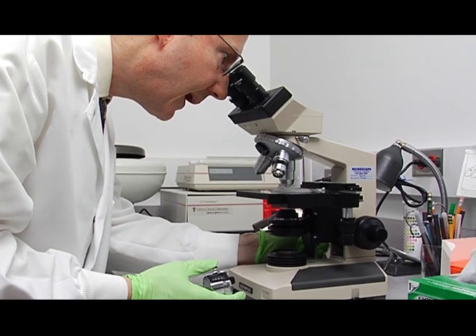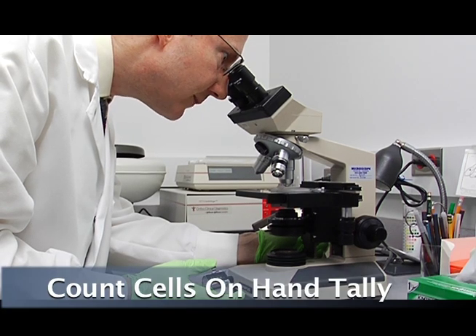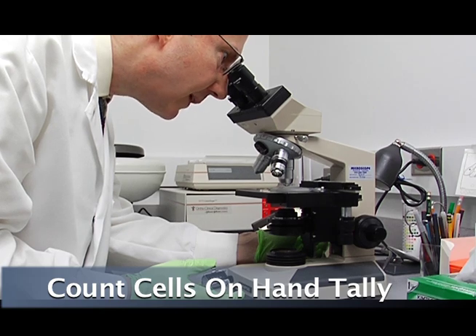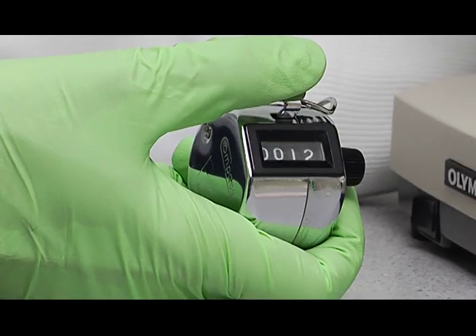The cells will show up as dark or bright spots in the hemocytometer. As you find each cell, click it on the hand tally.